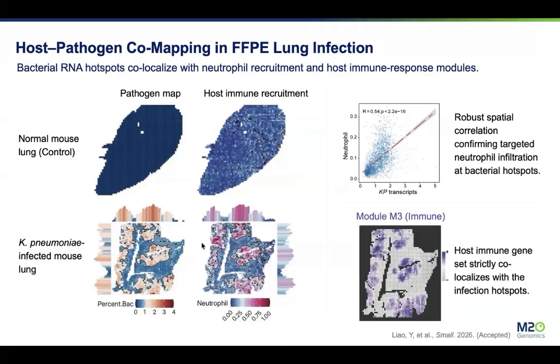The host immune response also shows spatial enrichment that corresponds with these bacterial hotspots, which indicates localized immune activation at sites of infection.